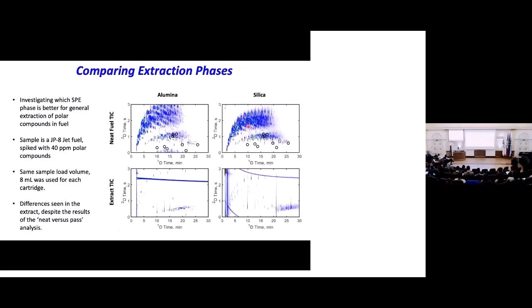And so since we think that what's going on here may be an interaction between the sample load volumes and the limited sample phase volume, we're getting the breakthrough effect, right? Where some of the compounds will inevitably be pushed off the cartridge by overwhelming it with extractable compounds.